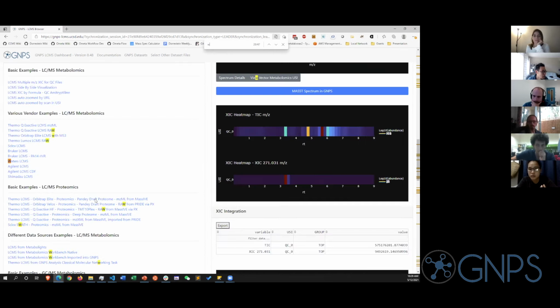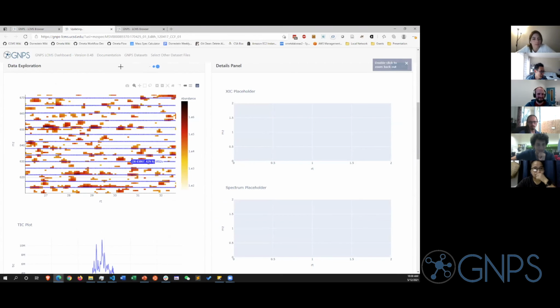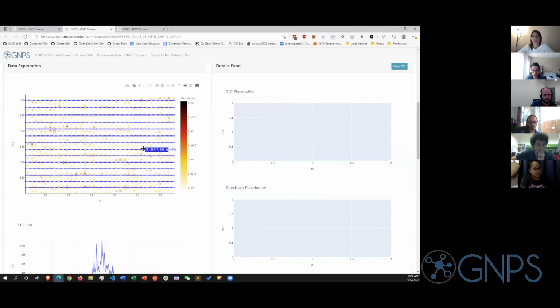The thing that you'll see with MSE that is somewhat interesting is very similar to swath data. So this happens to be DIA swath data. In difference from what Danny was talking about, where the MS2 points depend upon the data and only appear where the heat map has actual signal, swath data is by definition data independent. You see these straight lines, MS2 scans everywhere.